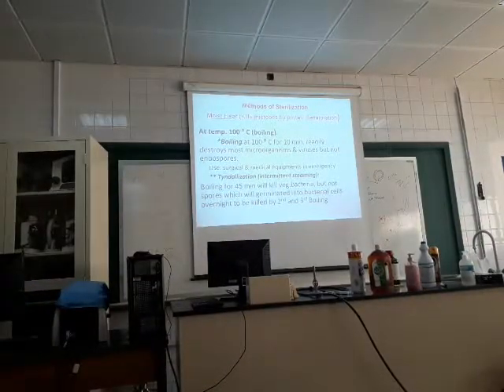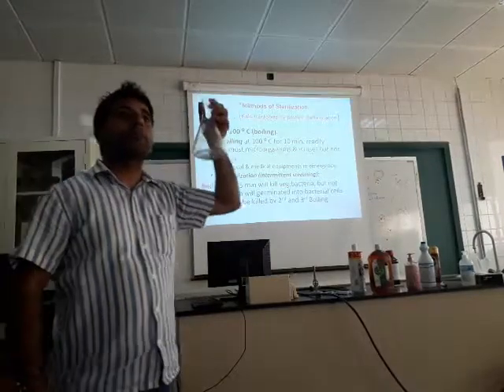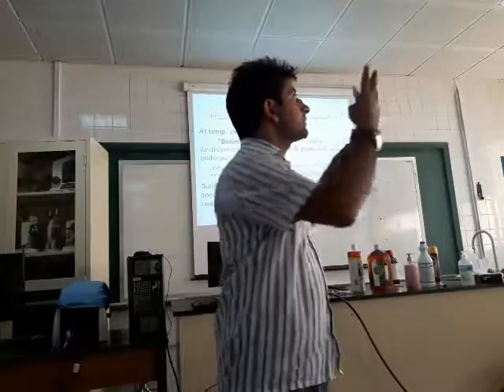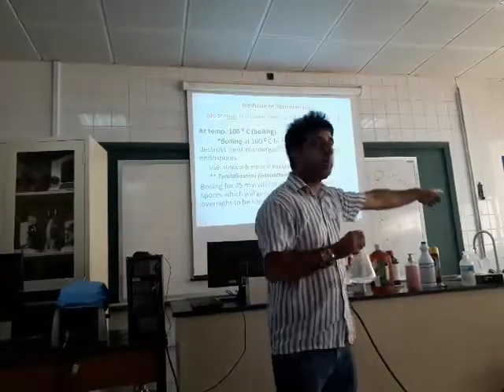He made it sterilized. This is called tyndallization. But do you know the problem? What is the drawback? You have to wait for 3 days. To get rid of the microbes, you have to wait 3 days. In the autoclave, how much? 15 minutes.